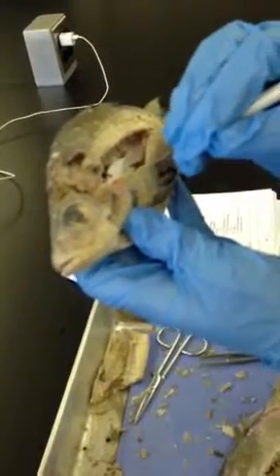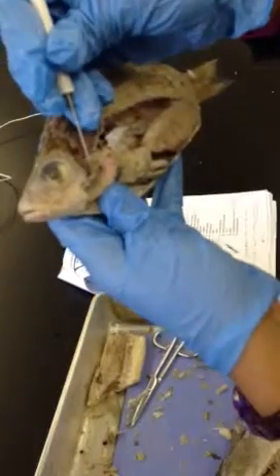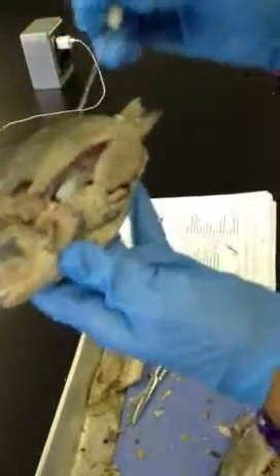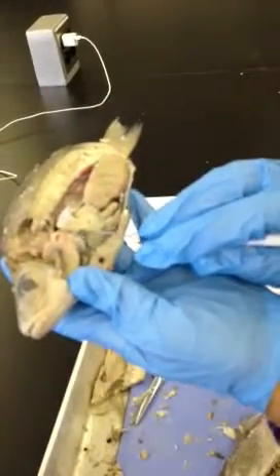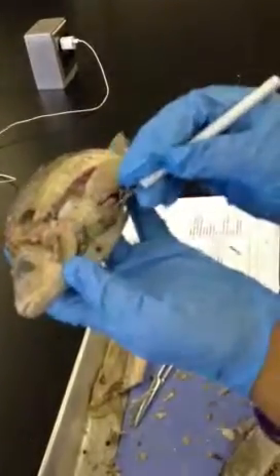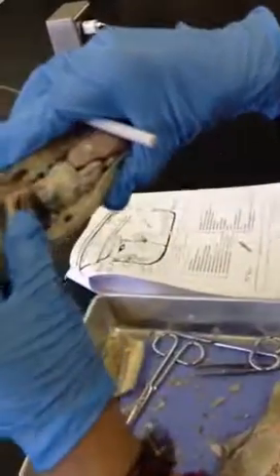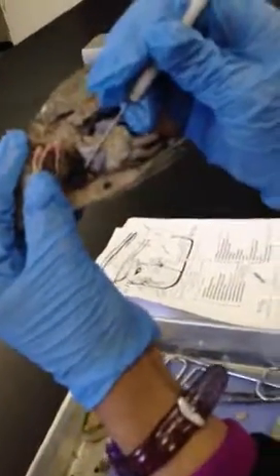This is the arch, the gill arch. These are the rakers right here. Right here are the gill filaments. Right here we have the liver. The liver is separated from the heart by a transverse septum right here. Right under the holobranchs, we have the heart. This is the heart of the perch.